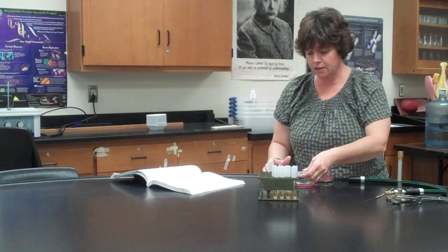If you're doing the blood agar plate, then you're going to cut across, like I was mentioning, and you're just making a little kind of cut into the agar. Don't cut too far to where the agar is going to crack. You just want to basically press down into the agar. And then, of course, as always, you're going to put the plates upside down in the incubator. These are all going to go into the 37-degree incubator.